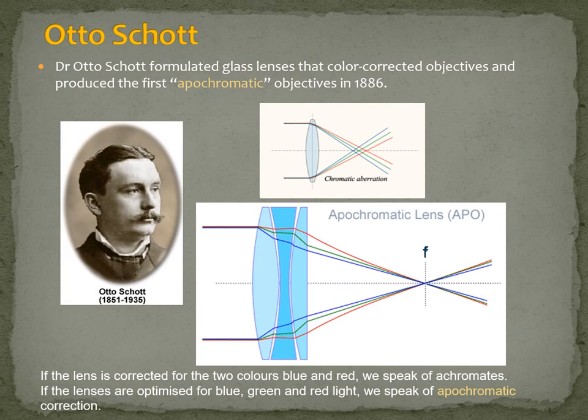The important thing was that not everything was yet perfect, although we could have that power of resolution. Lenses had to be improved, and they continued to be improved for a long time, especially in order to correct the different aberrations, chromatic aberration and spherical aberration. Depending on the color that we were looking at, we would have different problems.